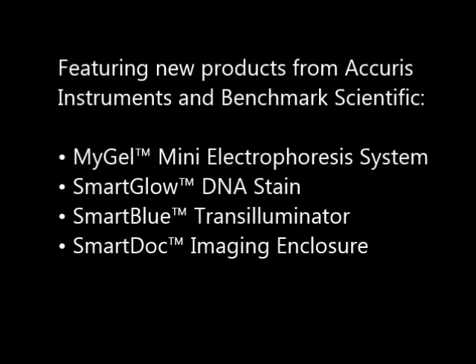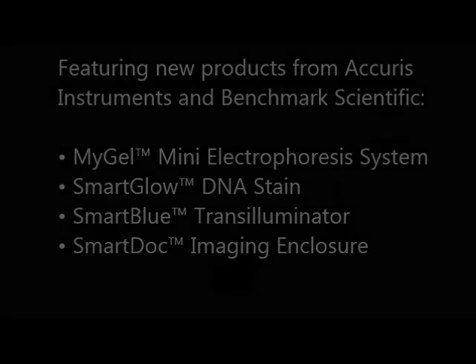During the demonstration we'll be featuring some new products from Accurus Instruments and Benchmark Scientific, including the MiGel Mini Electrophoresis System, the Smart Glow DNA Stain, Smart Blue Transilluminator, and our Smart Dock Imaging Enclosure.